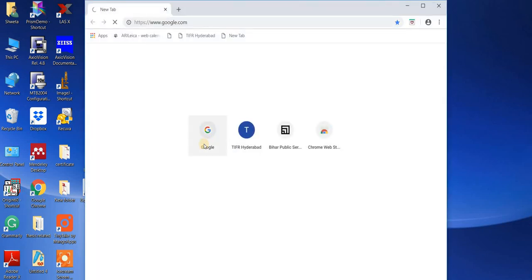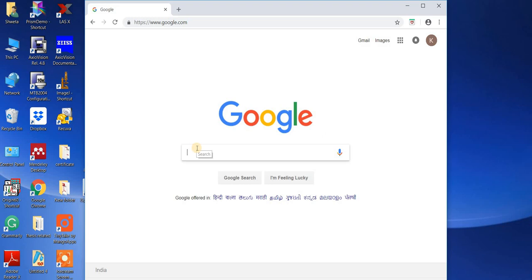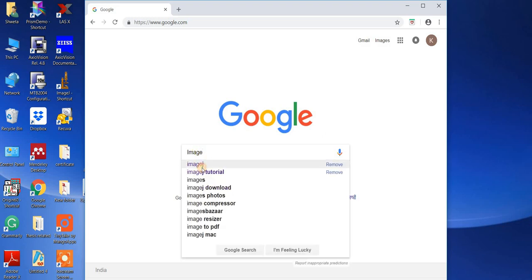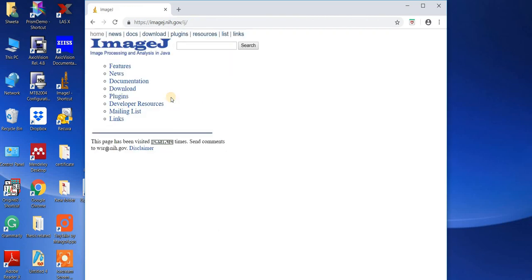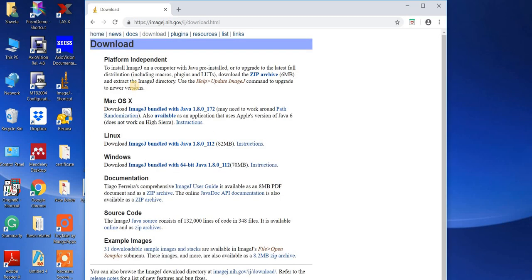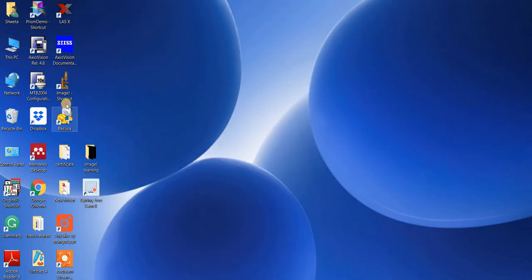To download the software, go to Google and type 'ImageJ'. Click on the NIH image slash ImageJ result. You will see different things available on that site. Go to the download section and depending on the specification of your computer, choose the appropriate version. Since my computer is bundled with Java 64-bit, I used that version. After clicking, you will get save and run options like any normal software.